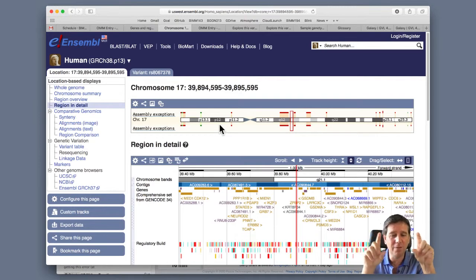track, and UCSC is somewhat similar to this, and other genome browsers you'll come across. They have this idea where they'll have what we call tracks, so different layers of information. So there's a layer up at the top, and then there's some other information below, and then as we scroll down, there's more information, all in different layers as we dig deeper into information about this region of the genome. So here we've got a little picture of the chromosome with its banding, the dye pattern. That's why they're called chromosomes initially, because they soaked up dye like nothing else, right? They really stuck out, and they've got these different dark and light bands that we all are probably familiar with. But you'll notice there's a little red box. You see this little box?